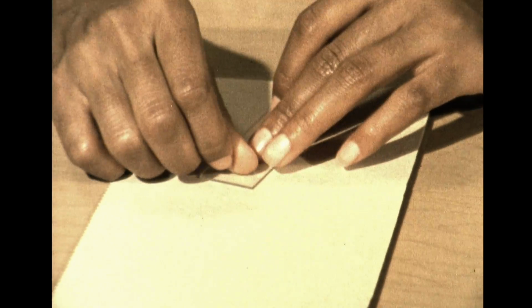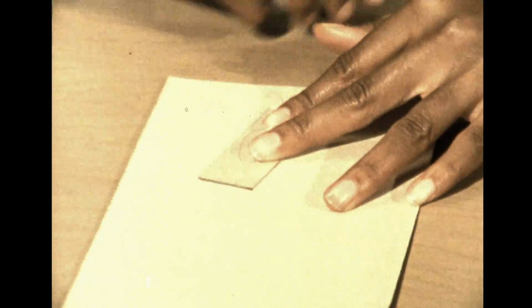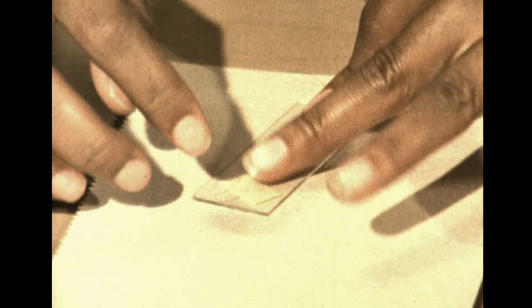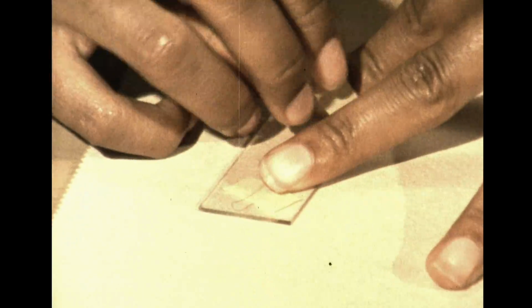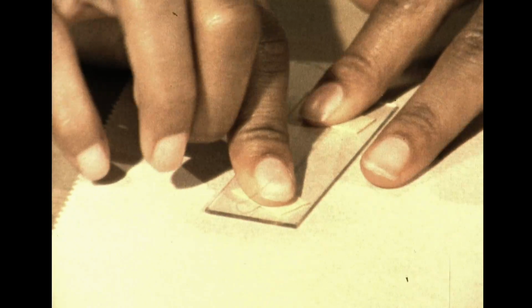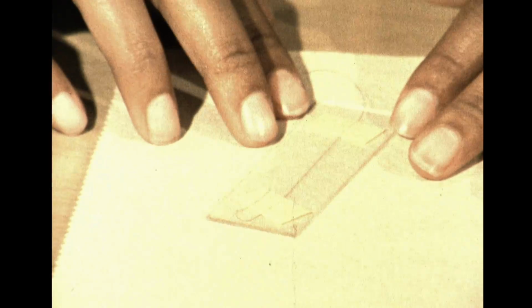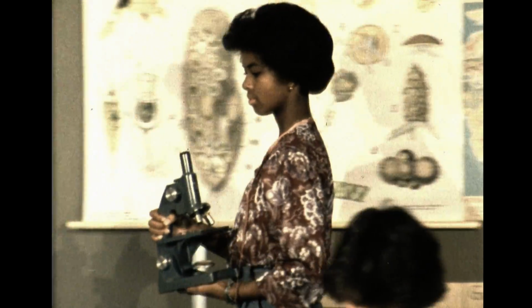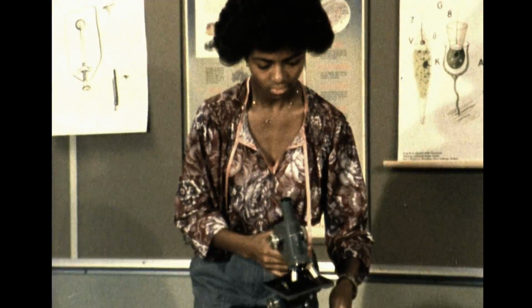The hair sample will be put on a clean glass slide. Dirt magnified hundreds of times may look impressive, but it isn't part of this experiment. The following 12 steps should be kept in mind when using a microscope. 1. Carry the microscope with both hands. One hand supports the base, the other hand holds the arm.